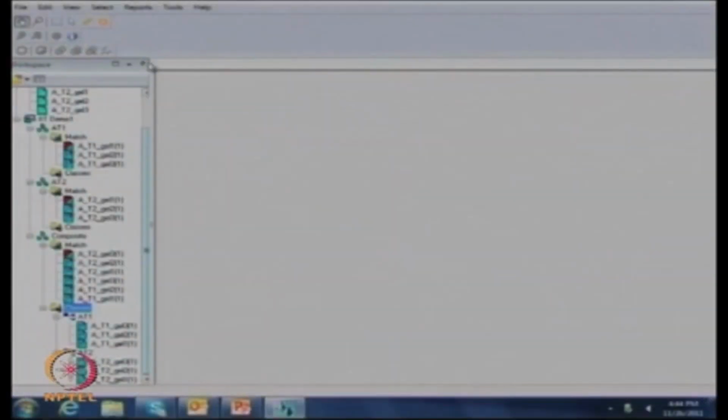So I guess it was very useful to see the different steps required for performing this analysis, and also that the software gives you a lot of options for doing different fold change and statistical analysis of how significant the data is. Then one can still go back to those spots which the software says are significant and look at each spot manually to verify that it is a real spot.